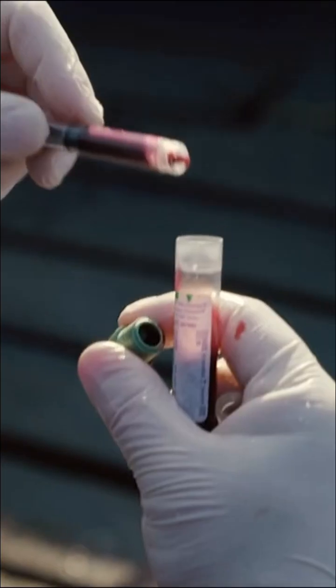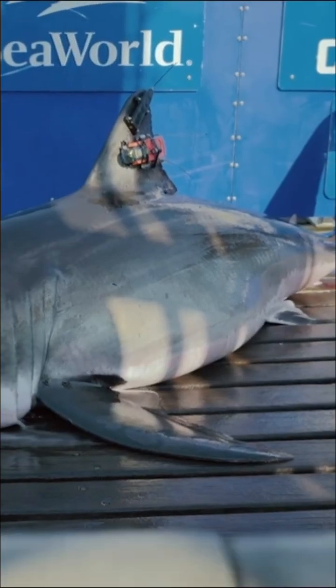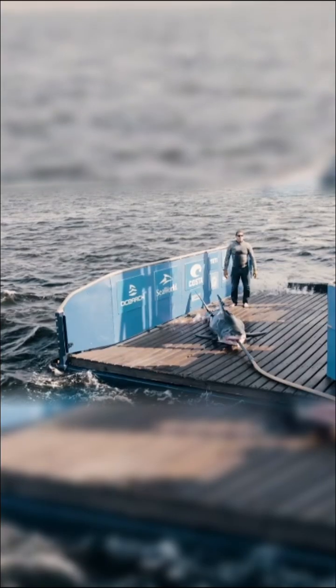The blood samples that we collect are going to be utilized for looking at the general health of the shark, so we're looking at complete blood counts and their chemistry — similar to what a veterinarian would use to look at your dog or cat, or what your own physician would use to determine if you're healthy.